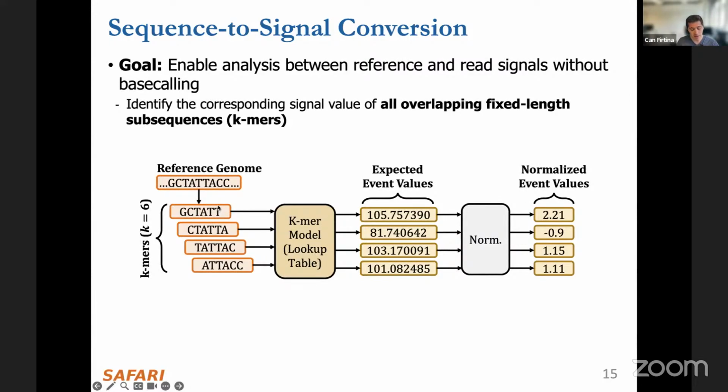This of course depends on the nanopore chemistry or the nanopore technology that we're using, but it is essentially because when you're sequencing a DNA molecule, we usually have a certain amount of DNA bases within a nanopore. In some cases we usually have 6 bases. It again depends on the chemistry.